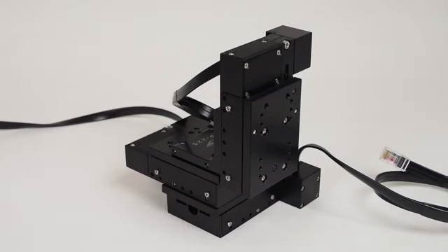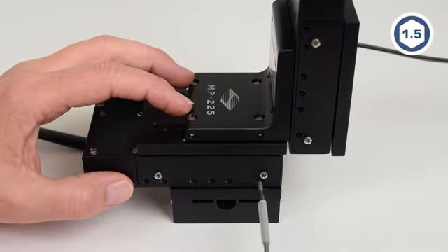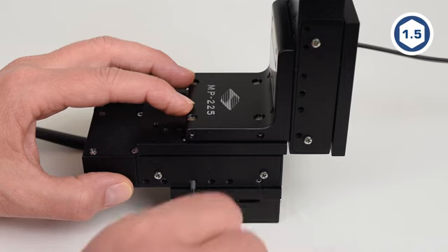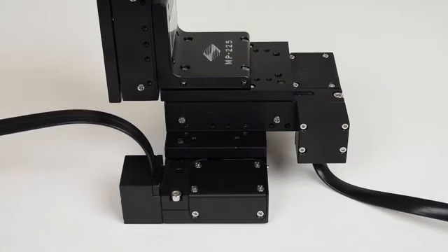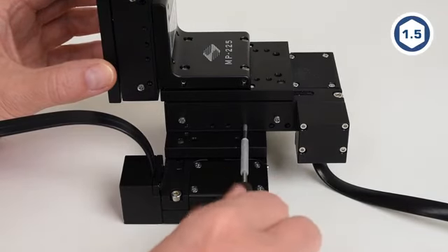In order for the home position to be correct and the diagonal to work properly, you need to change the handedness of the MP-225 manipulator. First, loosen the set screws in positions 1 and 4 on one side of the y-axis. You only need to loosen the screws a few turns. You do not need to remove them. Then, loosen the screws in positions 1 and 4 on the other side.